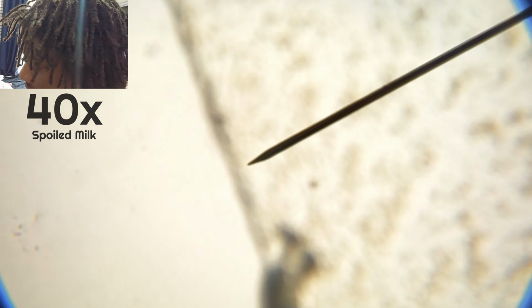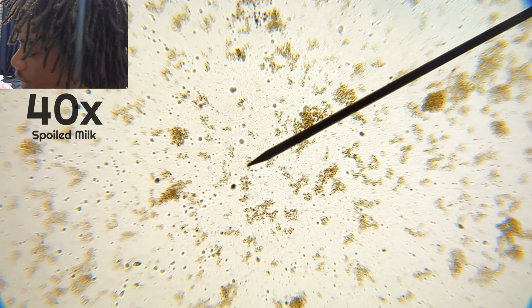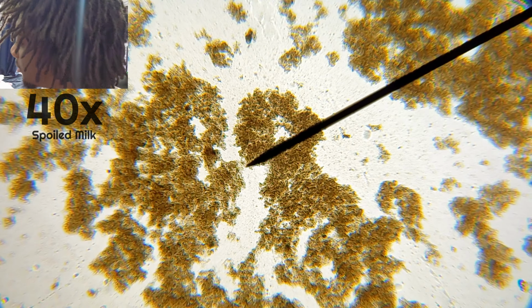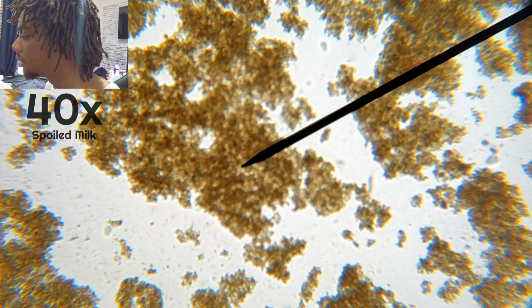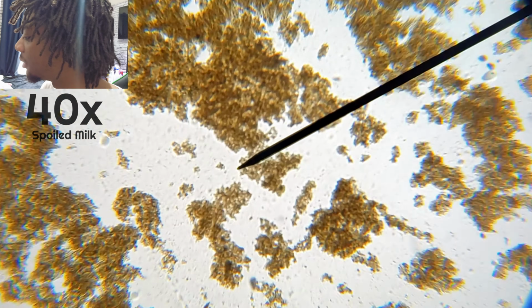Alright, so I got it set up. I don't feel like tilting it over, but I can see when I put the cover slip on it, I forget the names for stuff. I don't know why I keep forgetting names. When I put the cover slip over it, I can kind of see a bit of the curd, I believe. So just gonna look at this right here. There's probably gonna be nothing but milk, curd, and bacteria. What if I could see the bacteria with this sort of thing? I've always wondered if that's bacteria that I see with this at times.